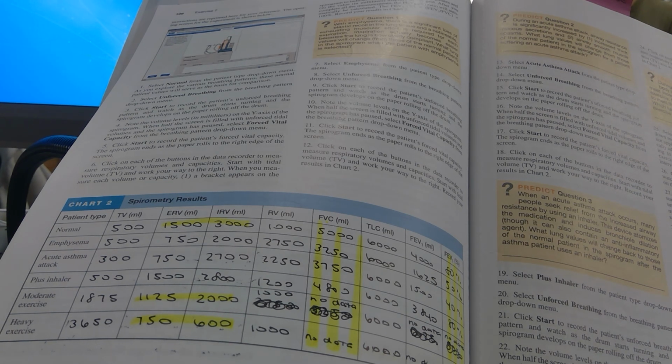And they got an FEV1% of 80%. Remember, all of us should be 80% or better. By getting 80%, that means 80% of your air out in the first second of exhale.